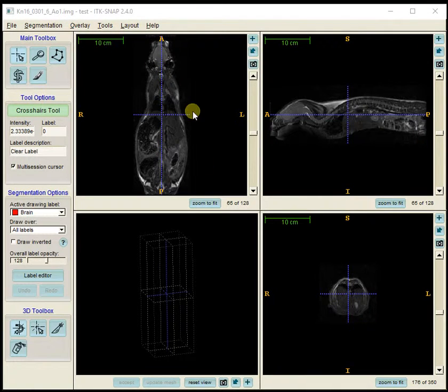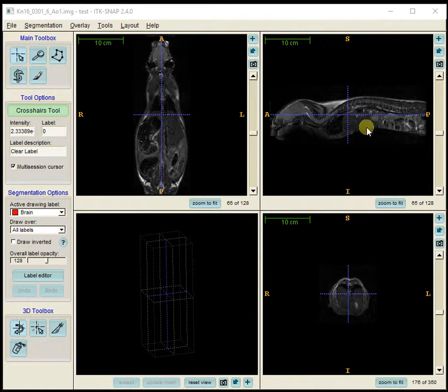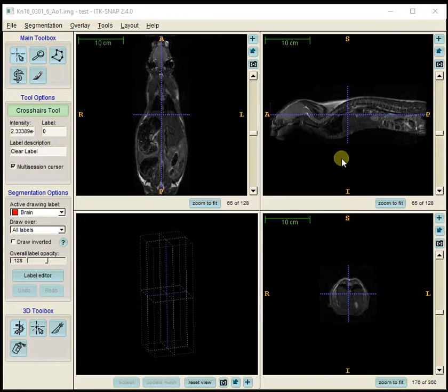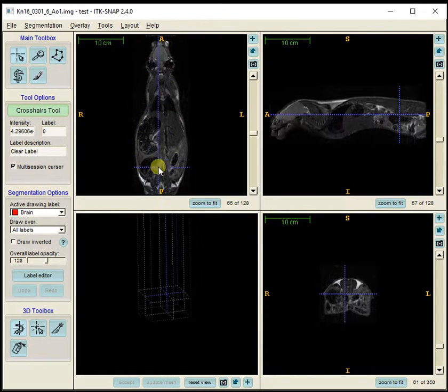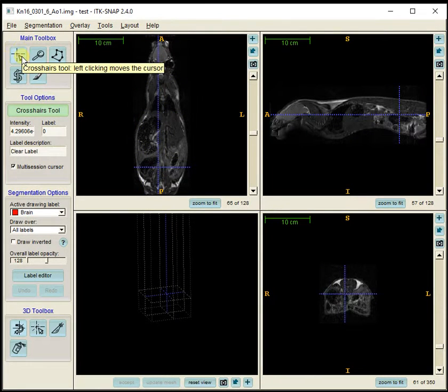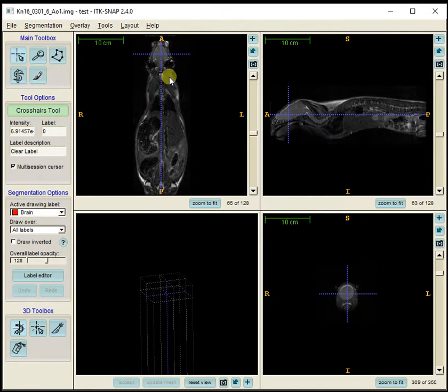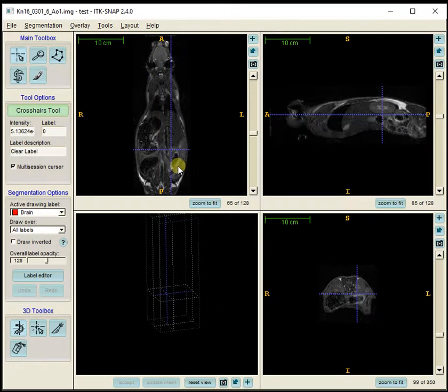Here are some basics about ITK-SNAP. This is a 3D dataset, and ITK-SNAP shows the different planes: the coronal view, the sagittal view, and the axial view. As I click around, the crosshair tool is selected by default, and as I click, the other planes move appropriately.